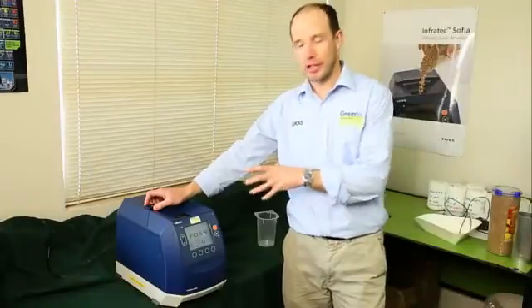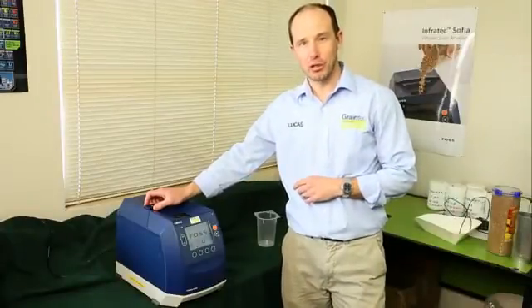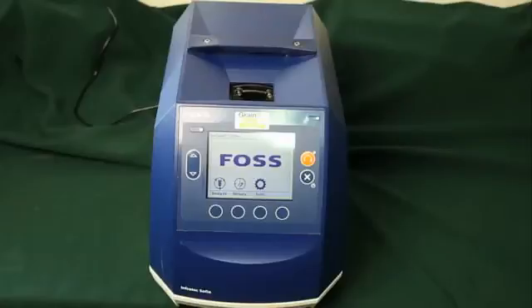Today I want to give you an overview of the Infratec Sophia and how it works. The FOSS Infratec Sophia is an on-farm grain analyzer for measuring protein and moisture.